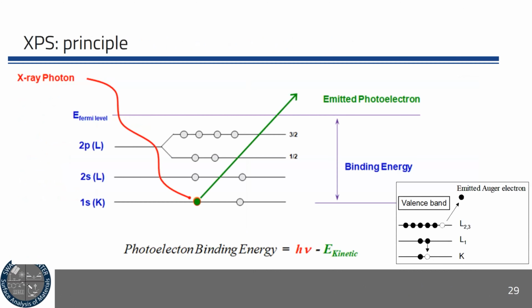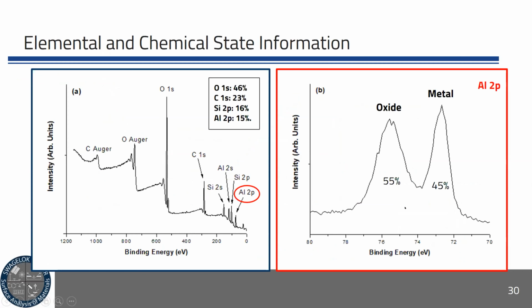Second instrument that we have is the XPS. We're using a soft X-ray to generate a photoelectron, and from the energy of the photoelectrons we reach binding energy by this relationship here. And we can also get X-ray induced Auger electrons in this case.